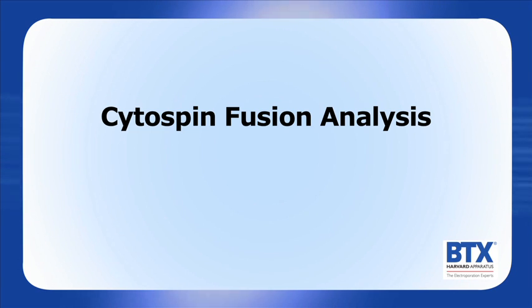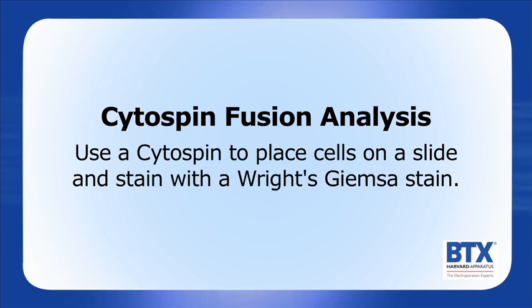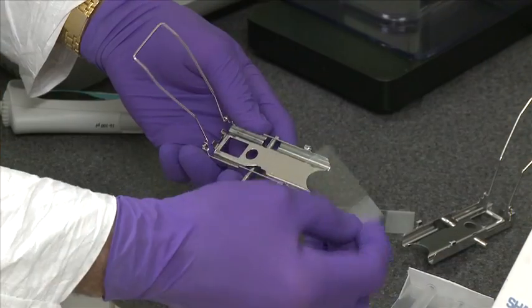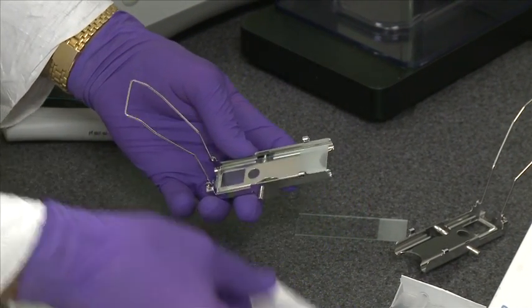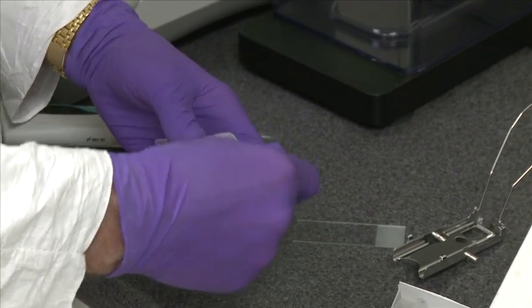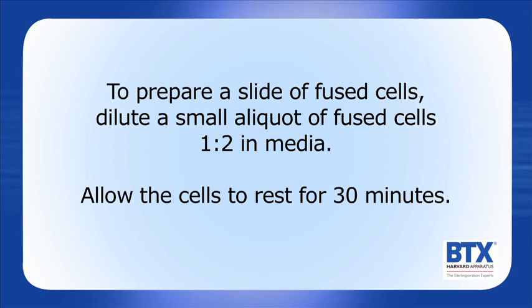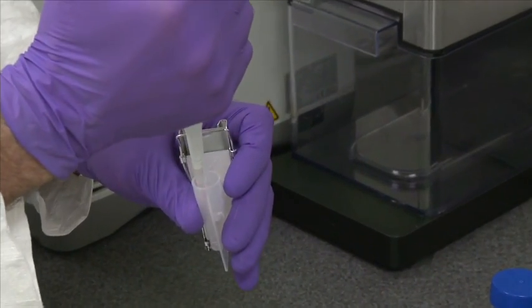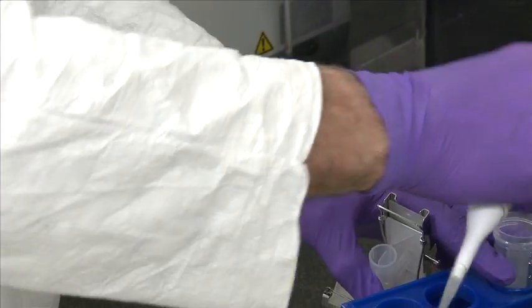It is helpful to analyze the cells immediately after the fusion to determine if there is a problem with the fusion itself. A simple analysis is to use a cytospin to place cells on a slide and stain the cells with a Giemsa stain. Assemble the cytospin apparatus by fitting the glass slide in with a double cytospin funnel and close the apparatus. Make a second one as a balance. To prepare a slide of fused cells, dilute a small aliquot of fused cells 1 to 2 in media. Allow the cells to rest for 30 minutes. Take 100 µL of fused cells and pipette into the cytospin funnel.